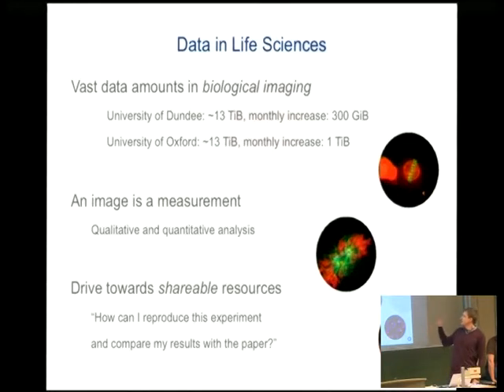An example you can see, those are pretty images, quite colorful. In 2 dimensions they look quite appealing, but what can't be seen here is the spatial information, the temporal information, multi-channel information. In reality, those are multi-dimensional images, and each channel, each modality has to be captured in the raw data. Hence the size of captured data, and hence also the drive towards shareable resources.